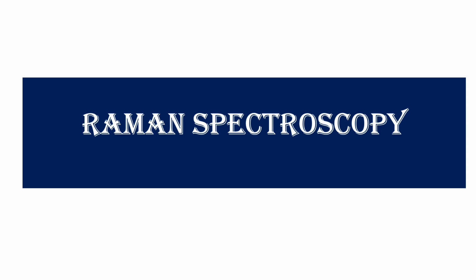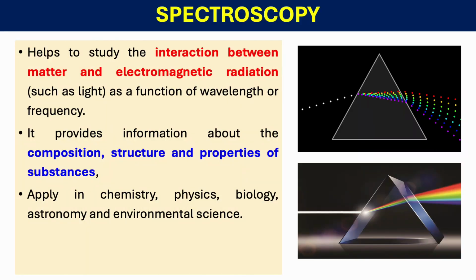Today I'm going to give you some idea about Raman spectroscopy. Before going into the details, let us try to understand what we mean by spectroscopy. It helps to study the interaction between matter and electromagnetic radiation like light as a function of wavelength or frequency. It provides information about the composition, structure, and properties of a particular substance. It can be applied in chemistry, physics, biology, astronomy, as well as in environmental sciences.